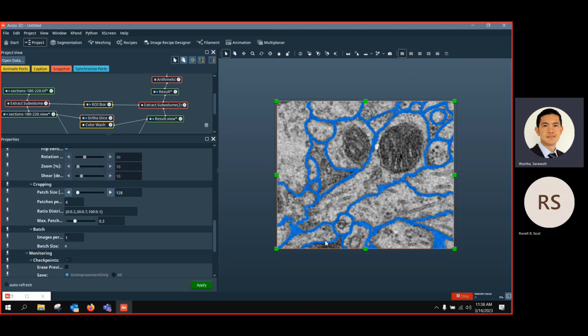In my experience, they're looking for membrane invagination of the IOM here, and it seems like they take the image on one side. The invagination of the membrane is always on one side. On the other side, it's just inside of the membrane or inside of the cell, so you will not see anything. So you expect that if you take another image of the other side, it would be able to be predicted. That's why you need to do augmentation. But with this, you just go around, it's quite evenly distributed.